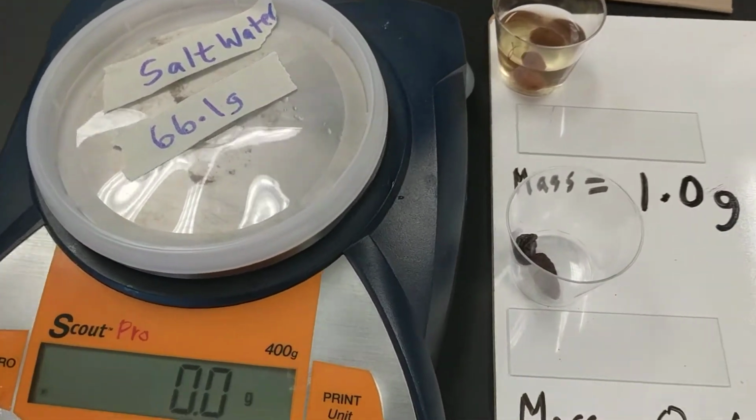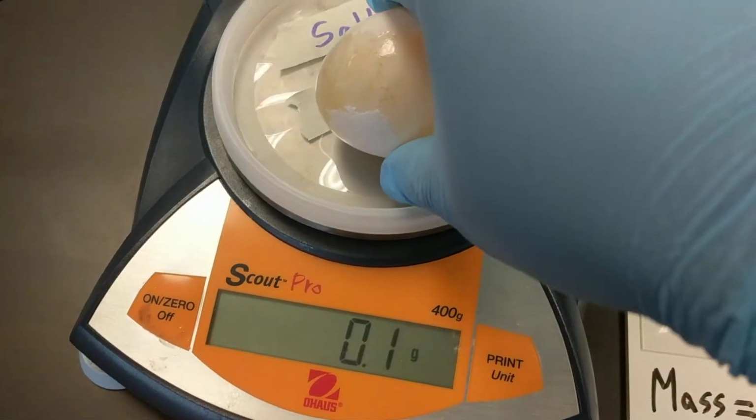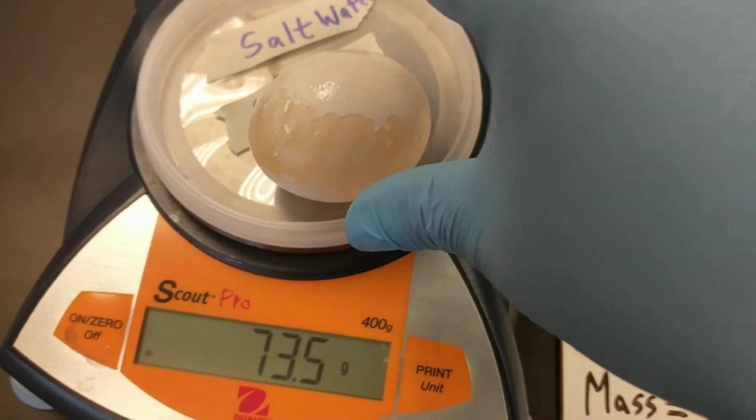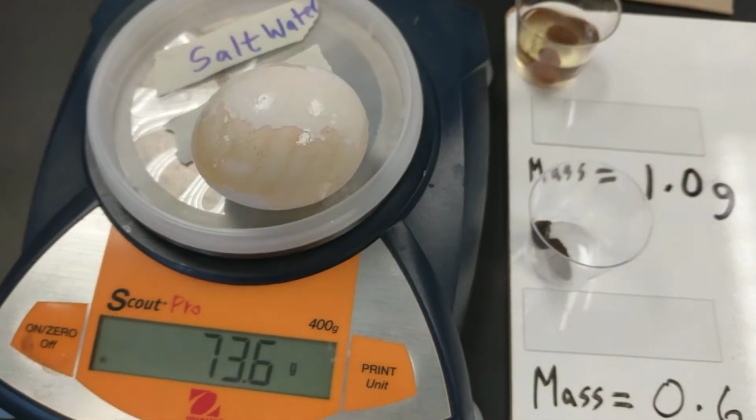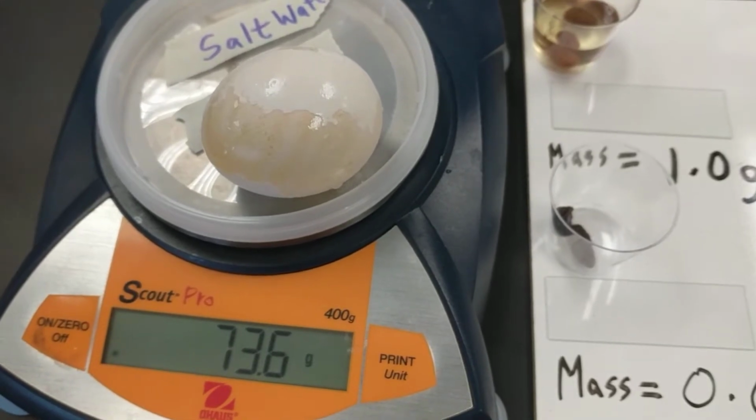After zeroing the plastic, place the egg on it, and the mass in salt water after 24 hours is 73.6.